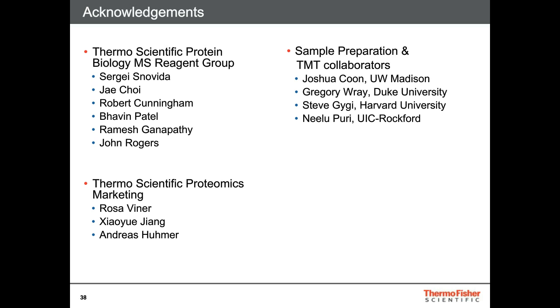Okay. Here's another question on depletion kits. Are there other depletion kits other than the top 12, like a top 20 or more? Not currently, but we have some of those in development, so stay tuned. Right now, we only have top 2 and top 12. There is a top 14 product, I believe, available from Sigma, but we do not have anything beyond the 12.